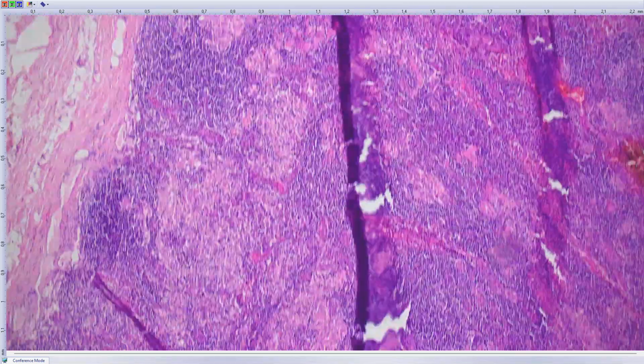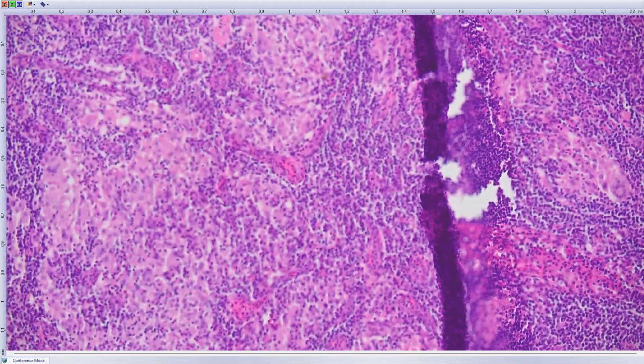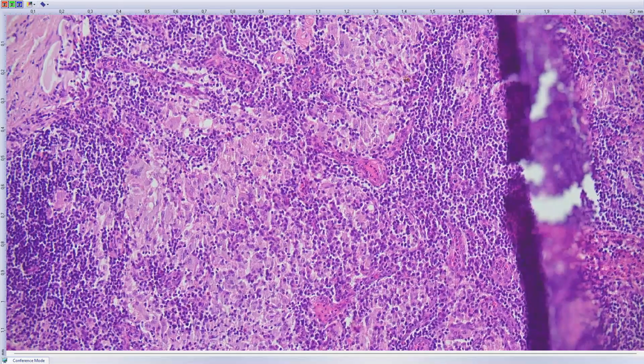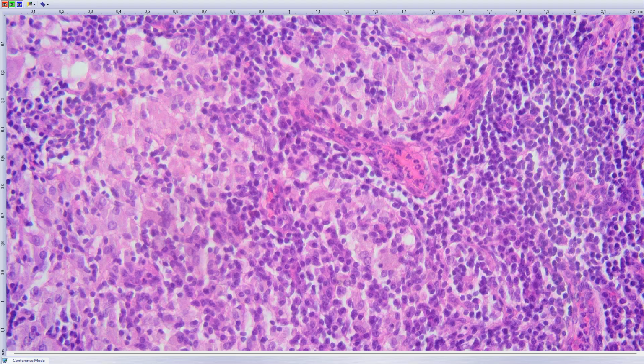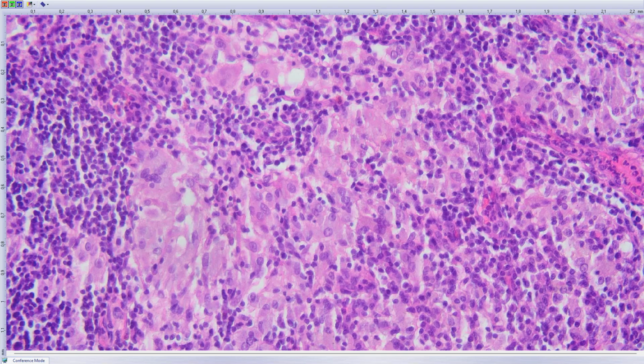And again, sinuses are packed, filled completely by these eosinophilic macrophages. If you stain them by PAS staining, they will be all positive. Sometimes in the lymph nodes you can see these dilated lymphatic channels. It's not present here in this biopsy.